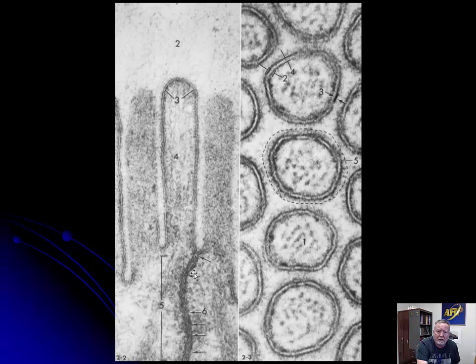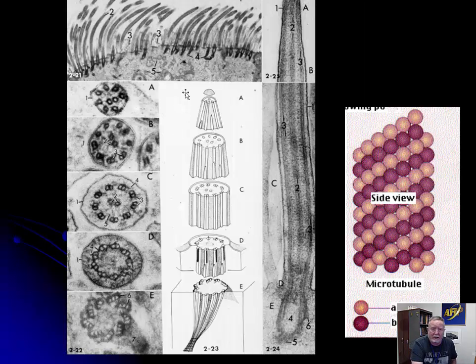And just one more picture of the microvilli cut in cross section. You can see the actin filaments. Here is the tight junction, gap junction, desmosome, as we've already seen. Now microvilli look very different than do cilia. Every epithelial cell has microvilli.